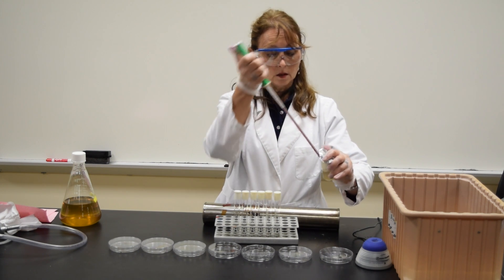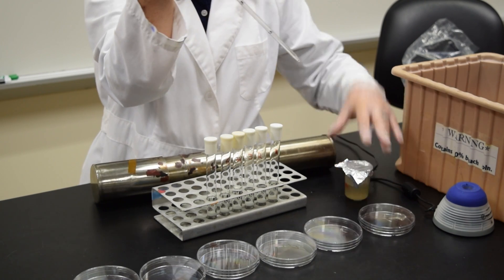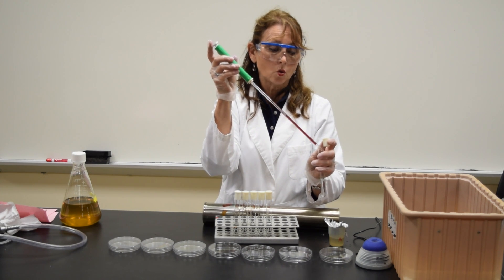Using the same pipette, I'm going to go into the original liquid, the 10 to the 0, draw up to the 1.0 mark, and add 1 ml to the first test tube that's marked 10 to the minus 1.